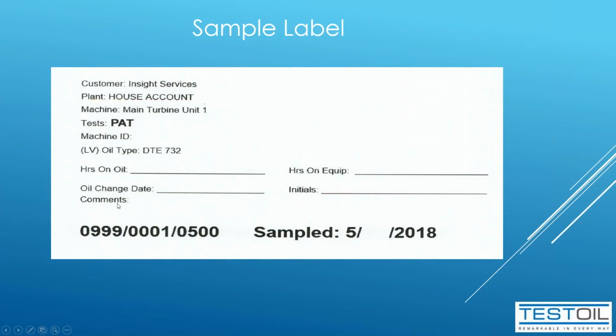And then it has right here comments, if you wanted to write any additional information that you would like on your report, you can put it here in the comments area, and of course your sample date.